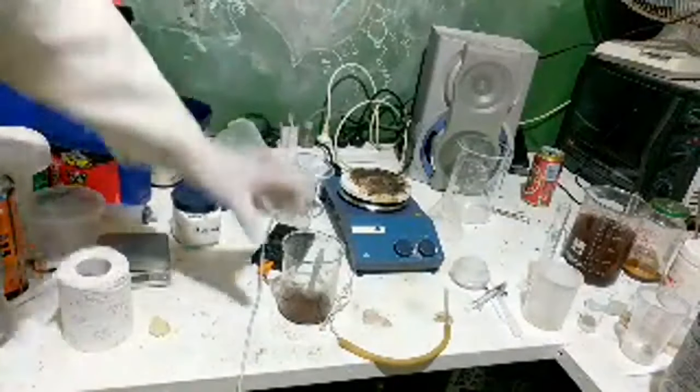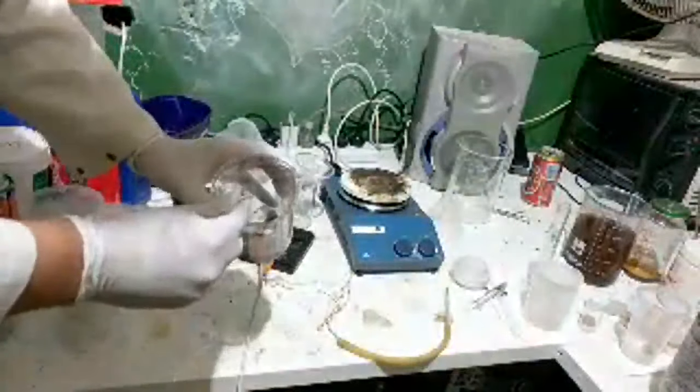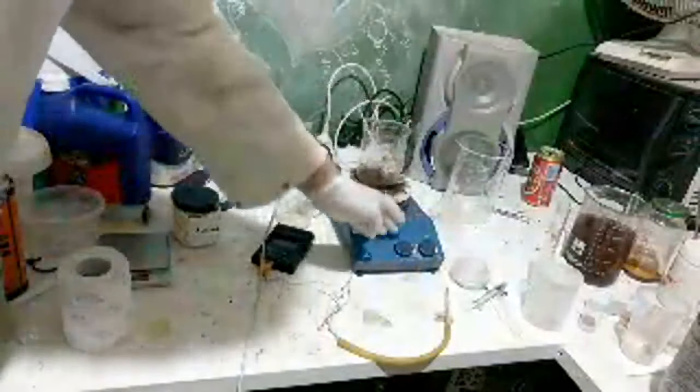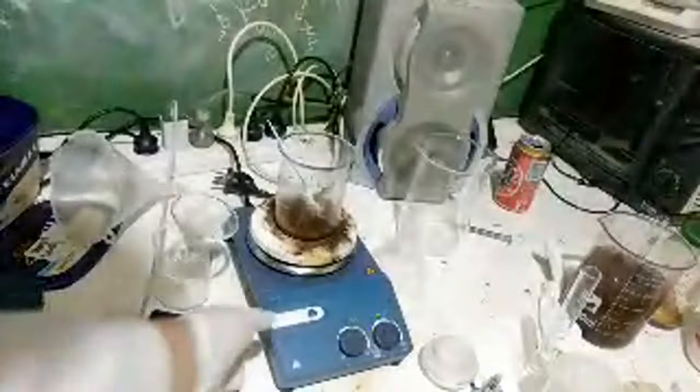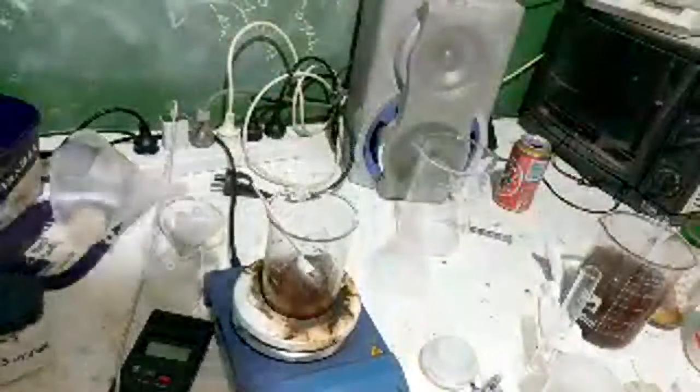Iron oxide isn't being very reactive, is it? Oh, it is dissolving a little. A little bit of heat. Probably doesn't fume too much. There's definitely magnetic iron still in there, because you can see it's kind of stirring a little, but there's no stir bar in there. Got a self-stirring solution. Oh, bleach! More bleach!